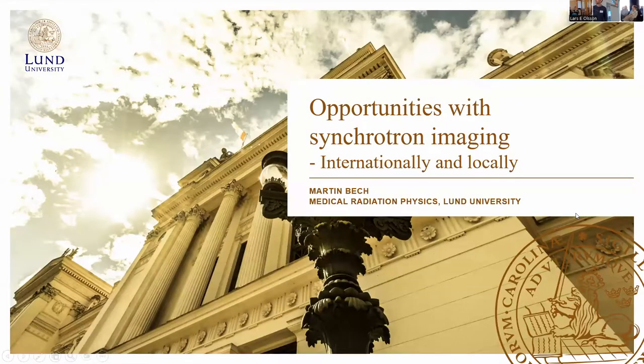The title of my presentation is Opportunities with Synchrotron Imaging, internationally and locally. I had a hard time figuring out what to put in this presentation because there's so much you can do. We have been talking about functional and anatomical imaging, in-vivo imaging, ex-vivo imaging, and depending on what you want to do and what you want to see, you can use different methods. The synchrotron is just a source of x-rays, and you can do anything depending on which beamline you go to.